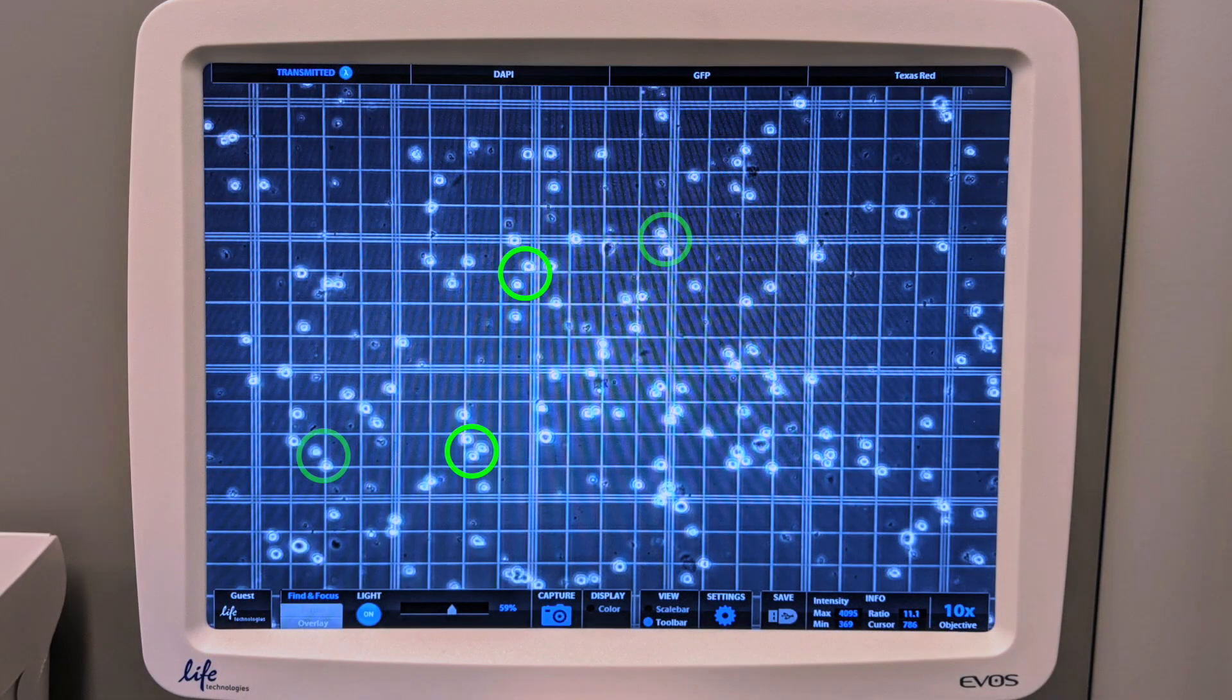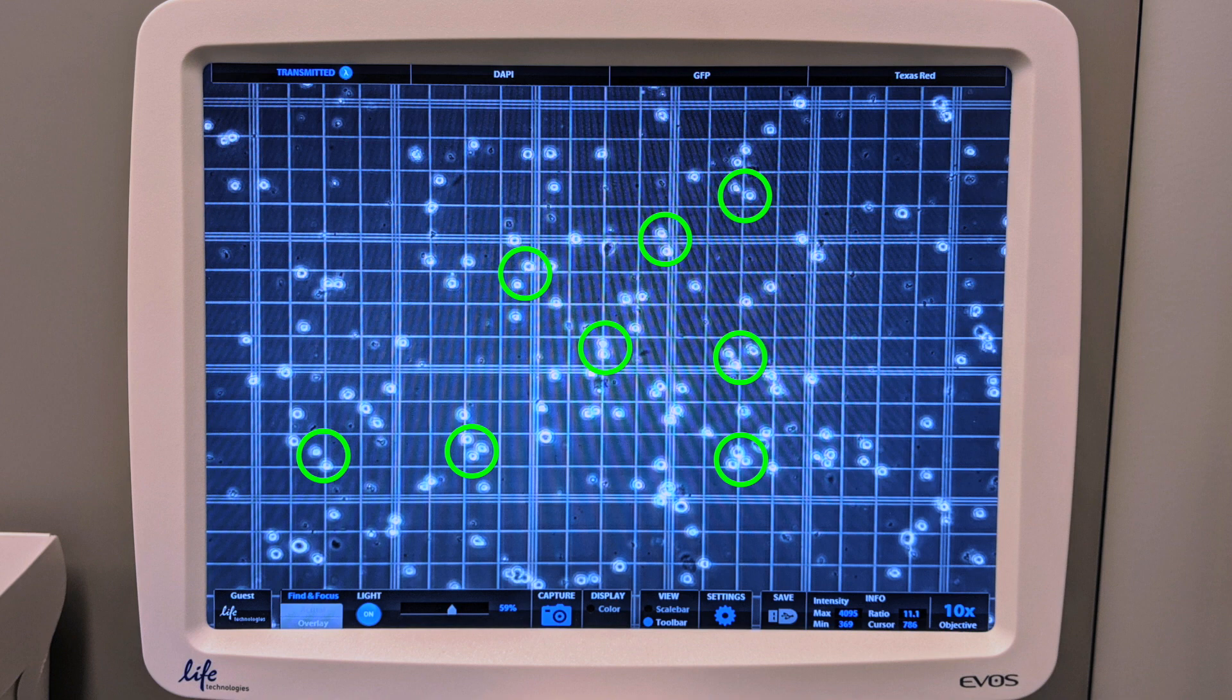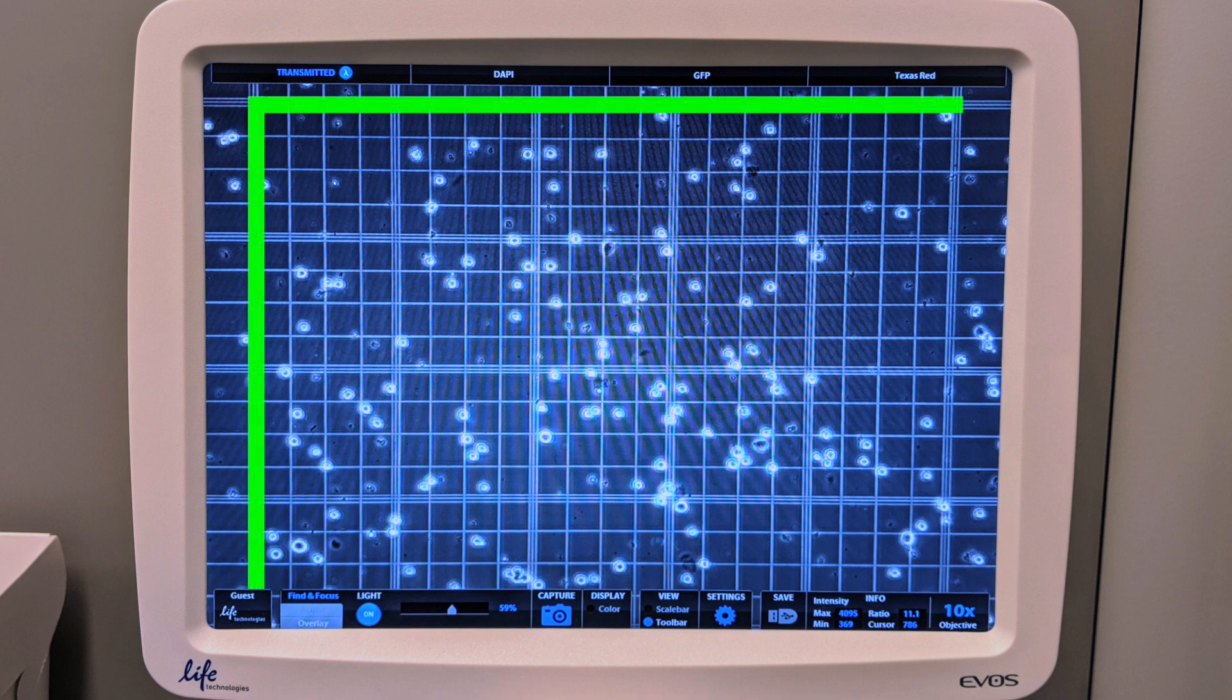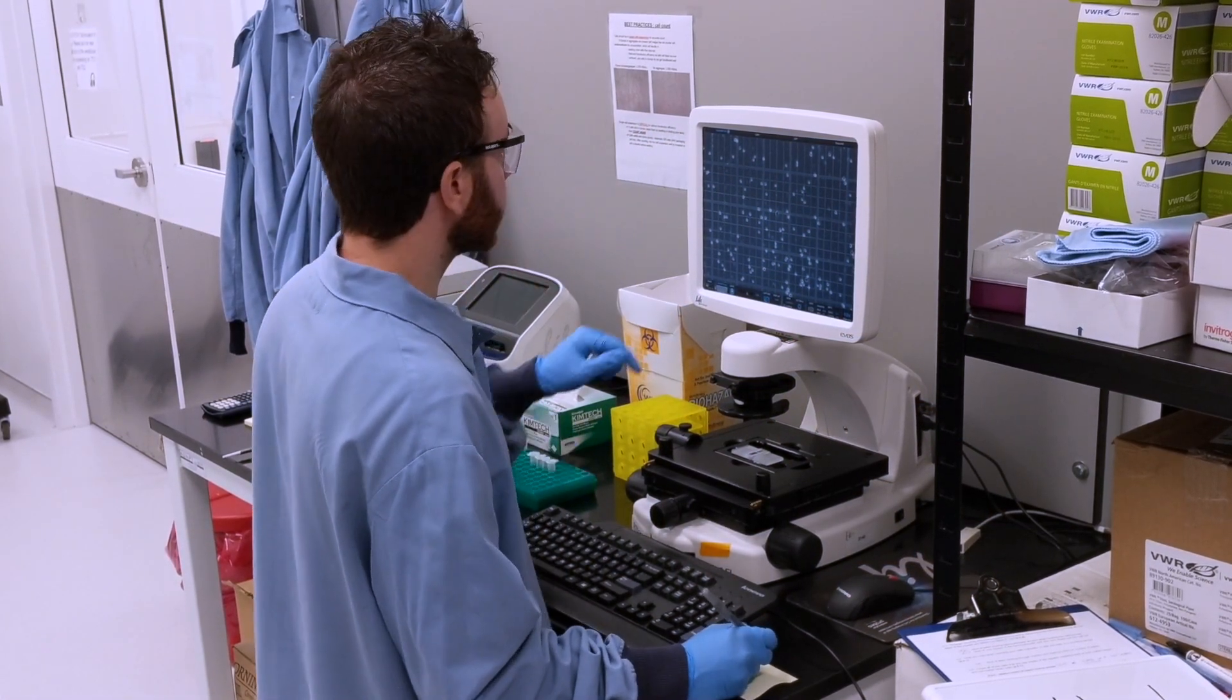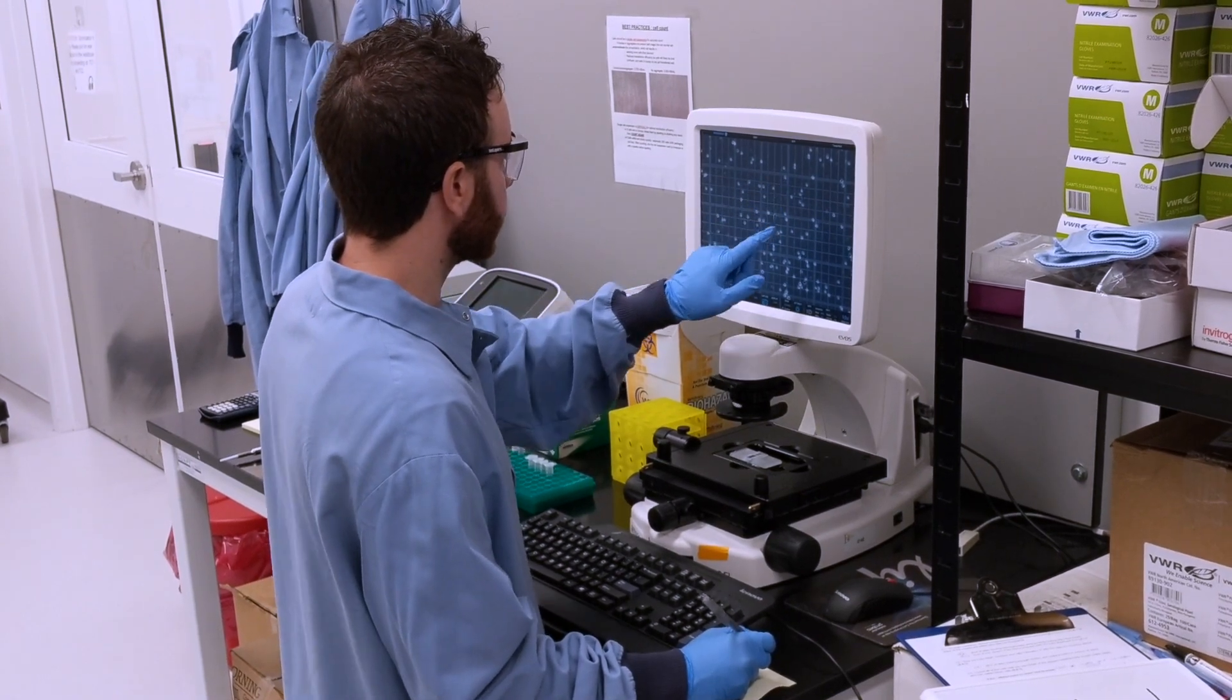Count all of the cells that you see inside of the square, keeping track of both the viable clear cells and the non-viable blue ones. To account for cells that touch the edges, count all of the cells that touch two out of the four sides of the square. To make sure you do this in an unbiased way, choose the same two sides for every square you count.